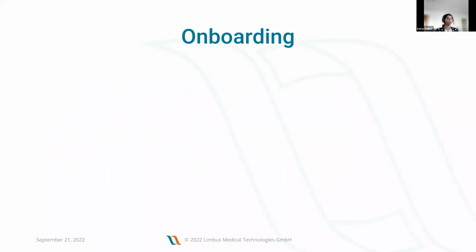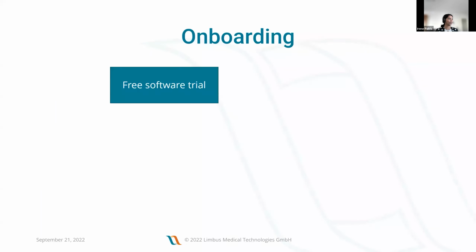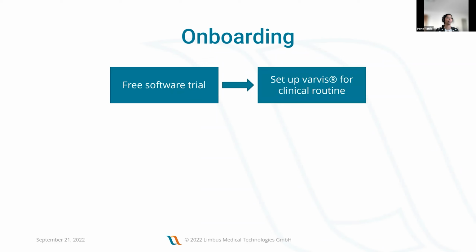Now, we've tried to keep onboarding simple and straightforward so that it's not a difficult process, but quite easy to go ahead, for which the starting point would be a free software trial. We have no obligations here, and we are able to guide you with a setup for clinical routine where the users will be able to test clinical cases in their trial instance.